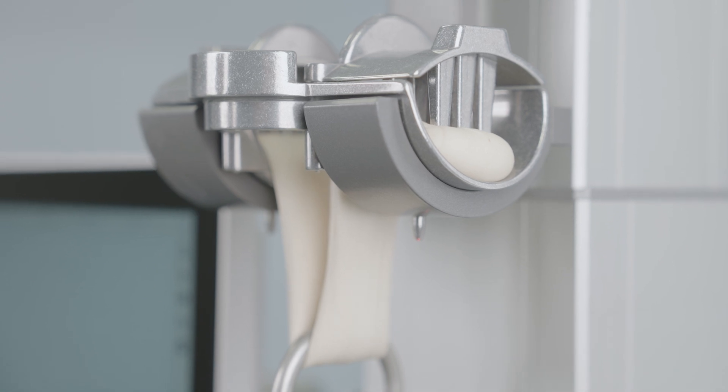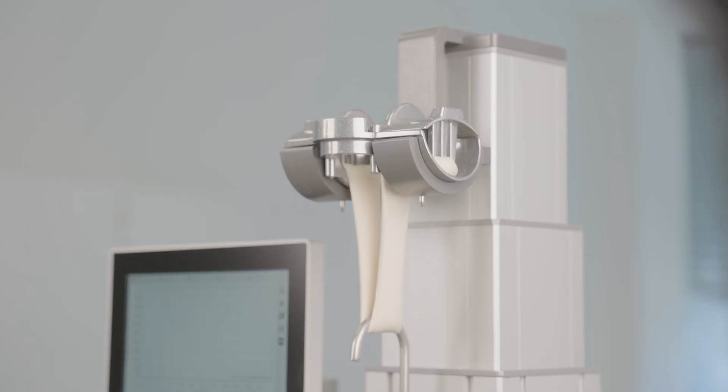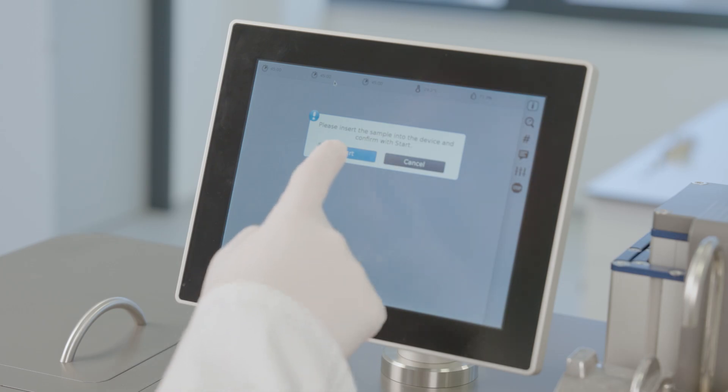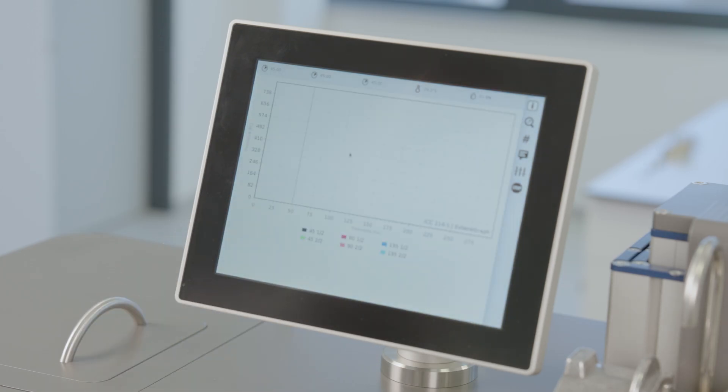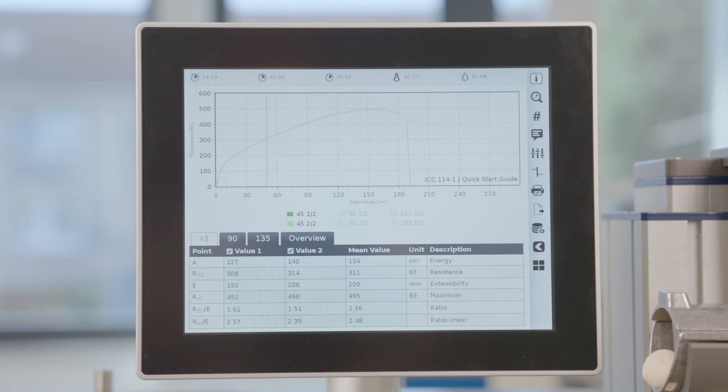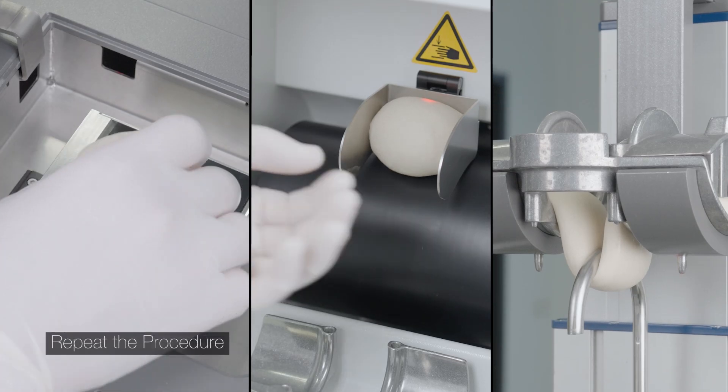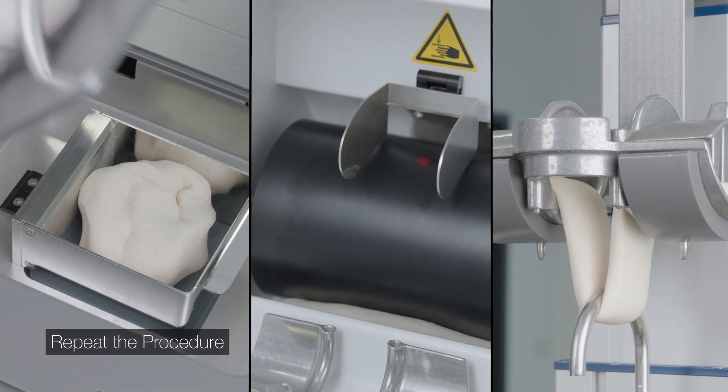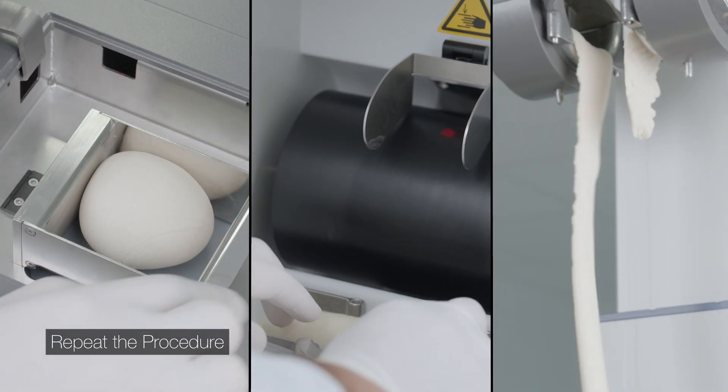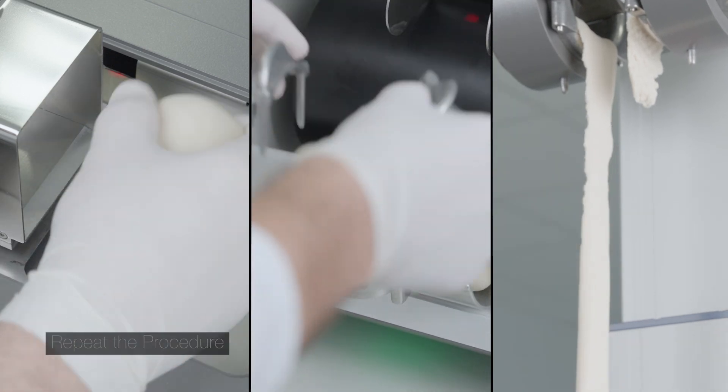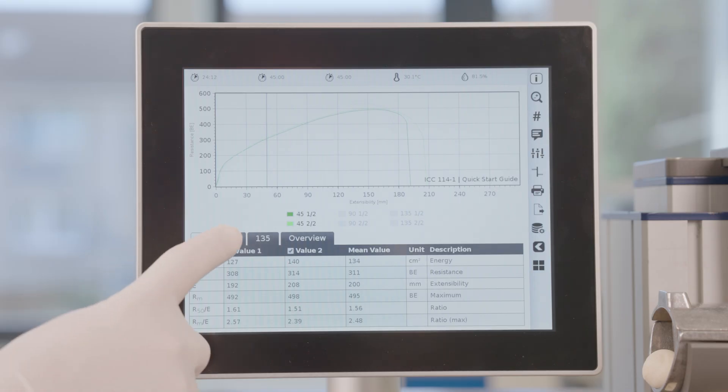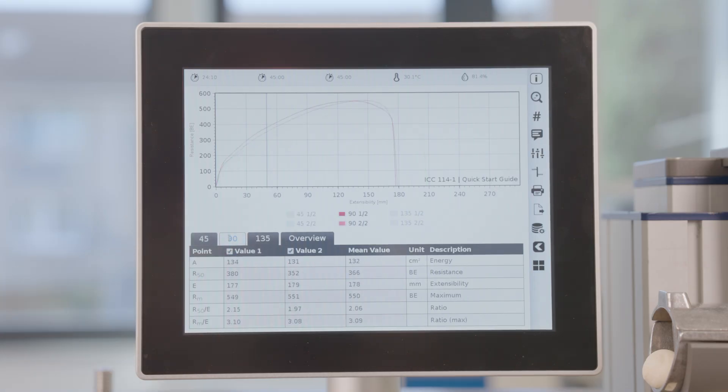The dough is stretched until rupture. Shaping, fermenting, and stretching are repeated three times using the same dough sample. Use the same procedure for the second and third measurements.